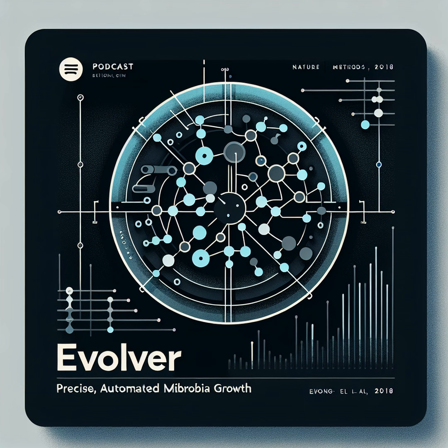So, what is the core problem that eVOLVER aims to solve? Before the advent of this platform, what were the limitations researchers faced when trying to perform these kinds of large-scale experiments? Essentially, traditional methods struggled to simultaneously achieve both precise control of experimental parameters and the high throughput necessary for large-scale studies. You needed either highly controlled, low-throughput systems like bioreactors, or high-throughput, but less controlled, batch cultures. eVOLVER cleverly sidesteps this trade-off, offering a customizable and scalable solution.